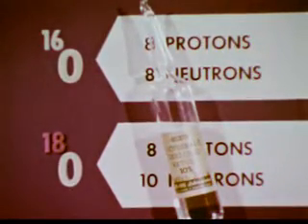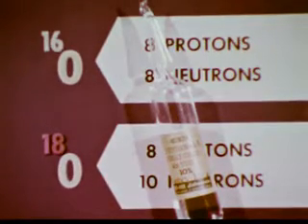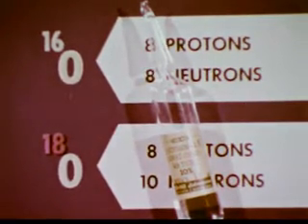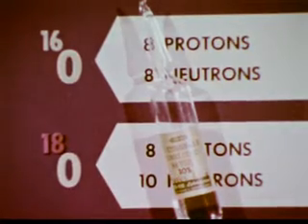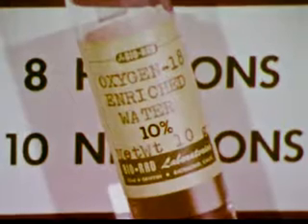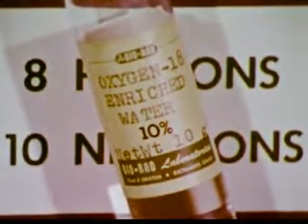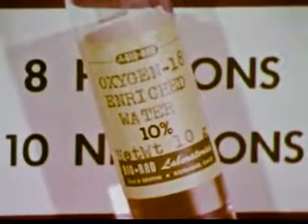Ordinary oxygen compounds contain only 0.2% oxygen 18. But here is a specially prepared sample of water, 10% of whose oxygen atoms are oxygen 18. Using this as our starting material, we can synthesize an ester in which 10% of the bridge oxygen atoms are the heavy isotope, oxygen 18.